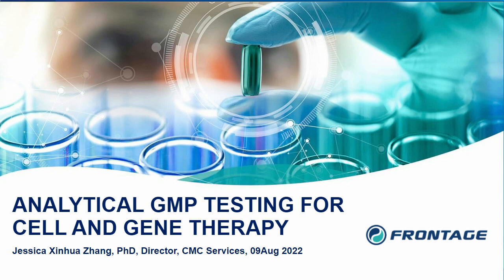And in this webinar, she's going to focus on GMP analytical testing in gene therapy products, introducing 3 critical test methods: AUC, infectivity, and RCL assays. Newly released FDA draft guidance for industry and human gene therapy products will also be discussed.